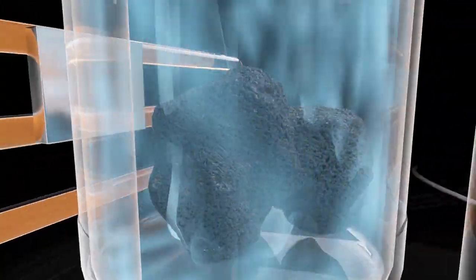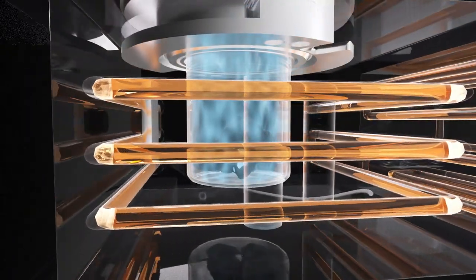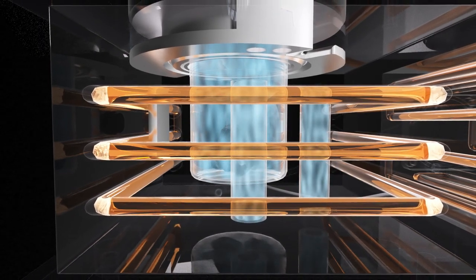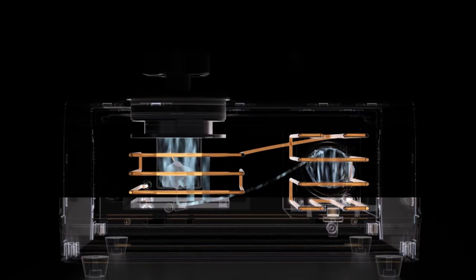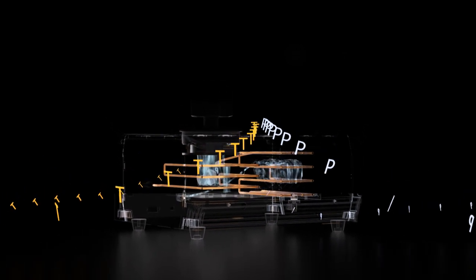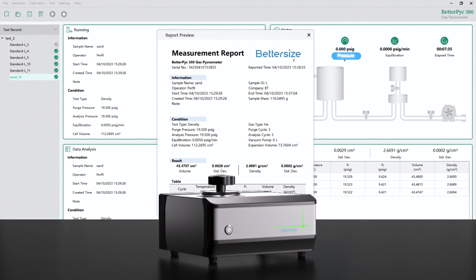BETTERPIC 380's high-resolution transducers enable comprehensive and accurate pressure measurement in both sample and reference chambers throughout the entire process. Thanks to precise temperature and pressure measurements, the instrument calculates the true density to four significant digits immediately.